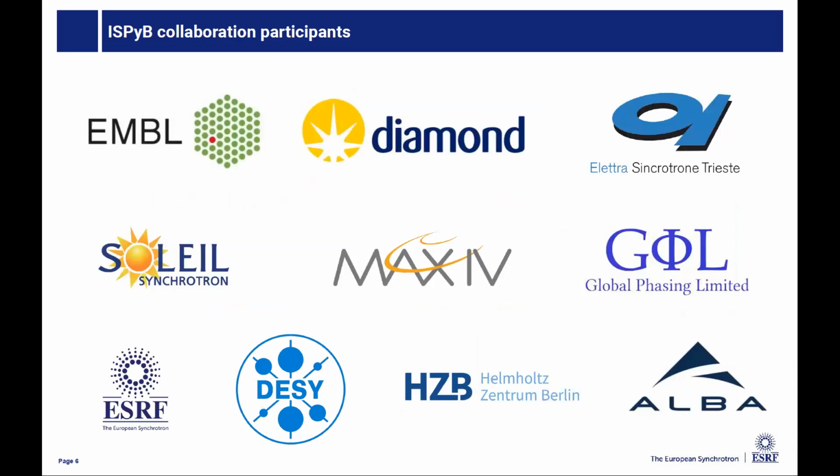So the system that I showed before is the one running at ESRF, but ISPyB is a collaboration across many facilities. You can see all of them here. They have different installations going on, but it's the same principle behind.